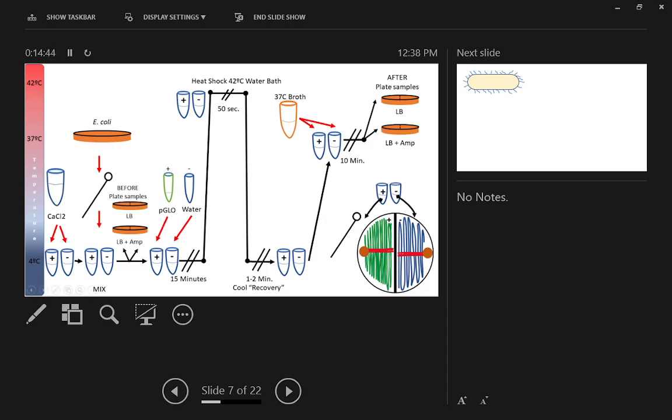But basically, you're going to get a sample of E. coli. This sample of E. coli you are actually going to be making on Monday through the Culture Transfer Techniques lab, which we'll talk about in a second. You'll take a colony from here and swirl it around in this mix of calcium chloride. Calcium chloride is the chemical that helps shuttle the DNA in, so it's a nice and handy methodology of getting this in.